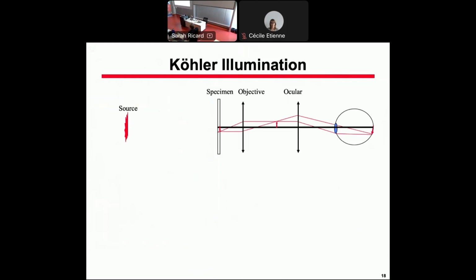The trick is, in reality, you have a transmission microscope, so somewhere there is a source. So mathematically speaking, you can imagine that these rays continue, and they come from different points of the source. So that you form an image of a sample, but rays which come from the source and follow the same path come from the same point of the source, so you do not focus the source.